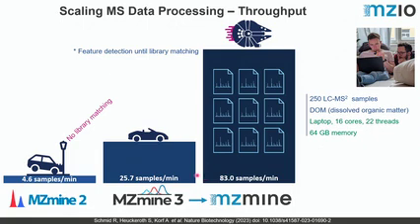In the recent releases, we sped up the processing really a lot. So if you're still on mzmine 2, I don't know, is someone still on mzmine 2 or mzmine 3 even, then totally please try the latest version. It's way smoother, way more stable, and also way faster than everything you have in mzmine 3.